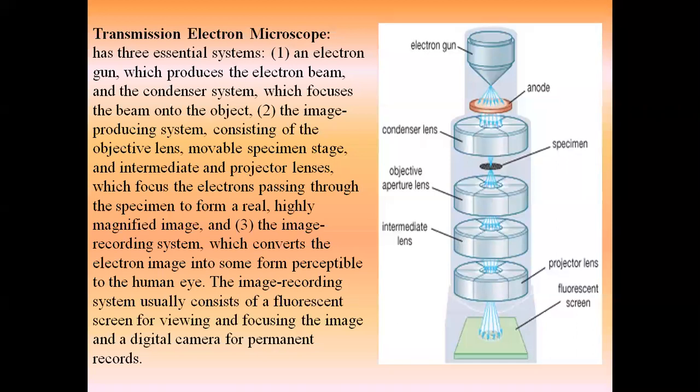The electrons coming out of the specimen pass through your objective lens and intermediate lens, and are finally projected through the lens on the fluorescent screen or the CCD screen, finally being transferred to the CPU, and you get the resulting image on the screen.